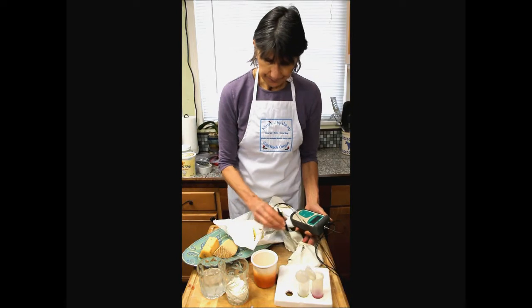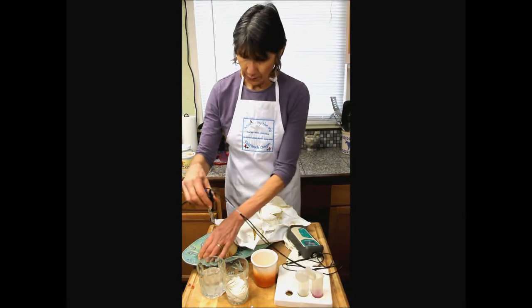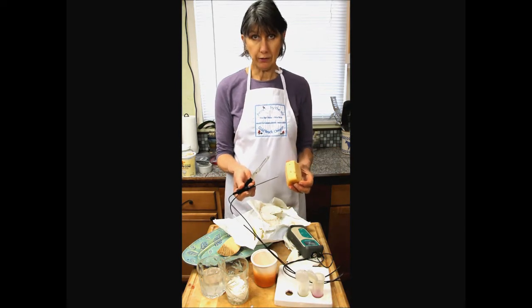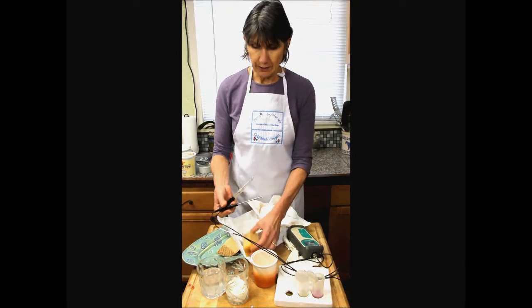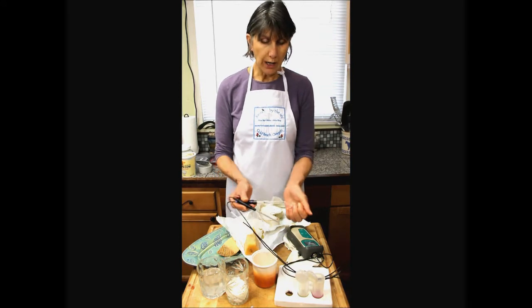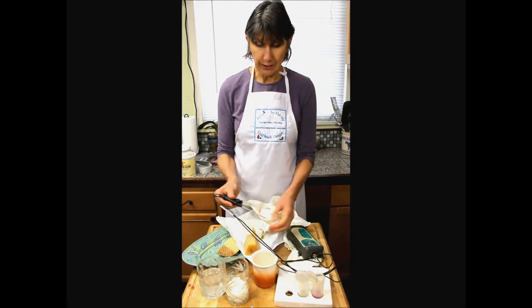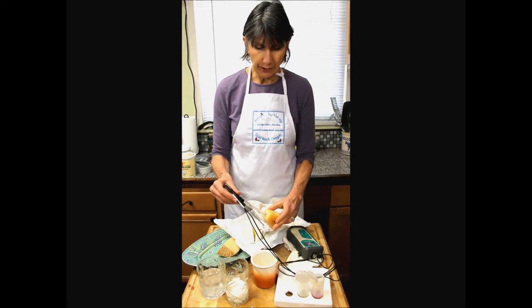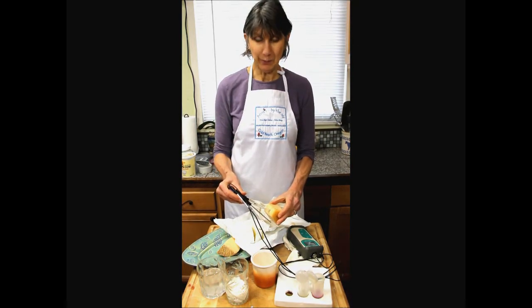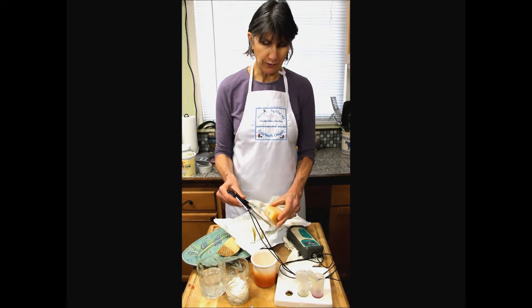Rinse it off. Let's try the hard cheese first. So hard cheeses, this is a spear tip electrode. If you don't have a spear tip, you can take a little bit of cheese curd in your hand, warm it into a wad, and insert your meter into that. This one though, I can push right down in there, and I'm going to push gently and slowly because I don't want to break the tip of my expensive electrode.